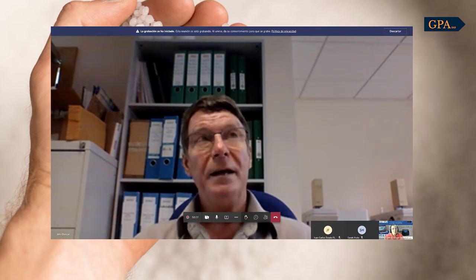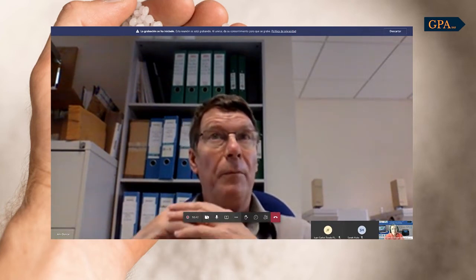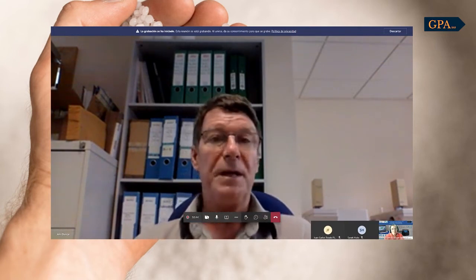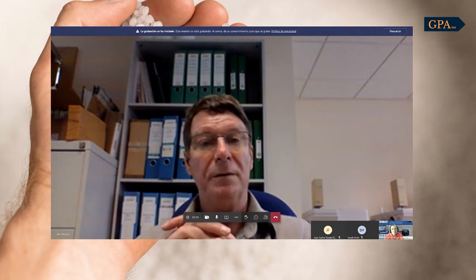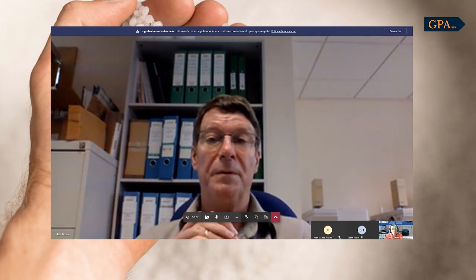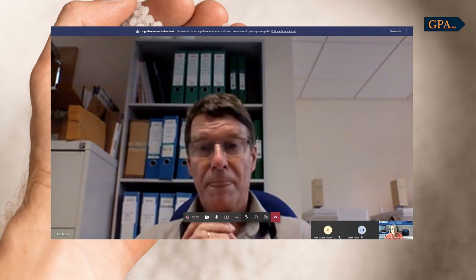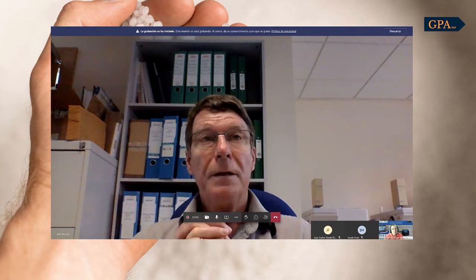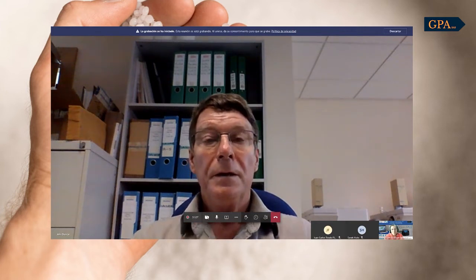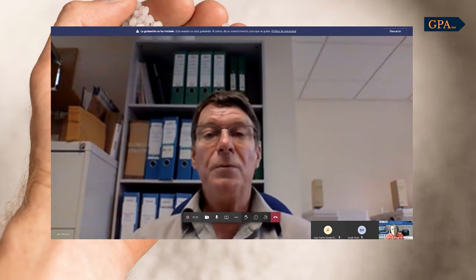And if it's just a couple of percent, you can probably accept it. Anything less than that, we probably wouldn't see it. But if it was about 10%, then obviously it's going to affect the properties of that material, and it may well not be acceptable. So does that answer that question? Yes. So just let me confirm the ranges. If it's more than 10% different, then you would expect not to use that, or at least you know the properties. Yeah, it would depend. It would depend what you're doing.